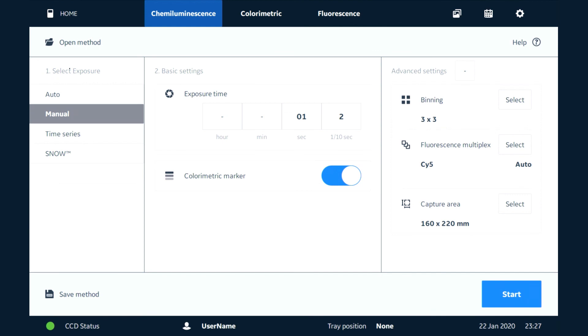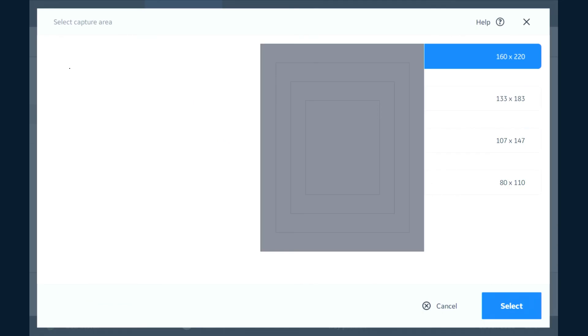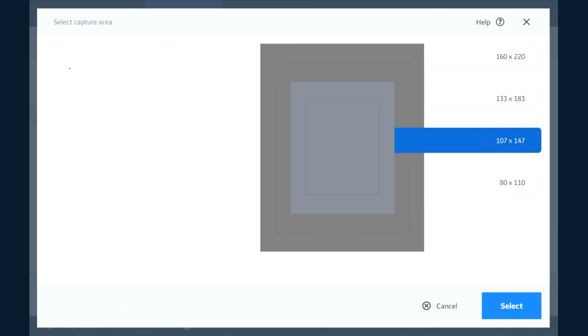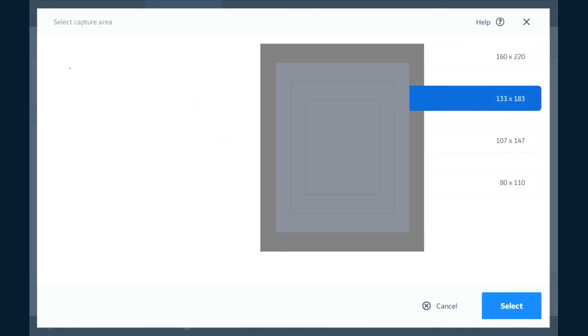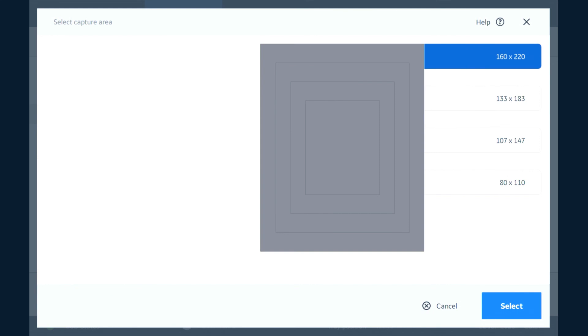The final thing we can look at here in the advanced settings is to select the capture area, and you can see this is a way to pre-crop our image if we have a smaller sample size than the size of the plate that we've selected.